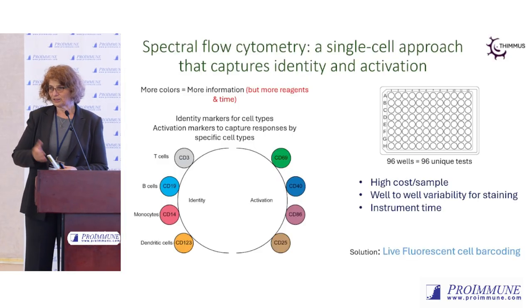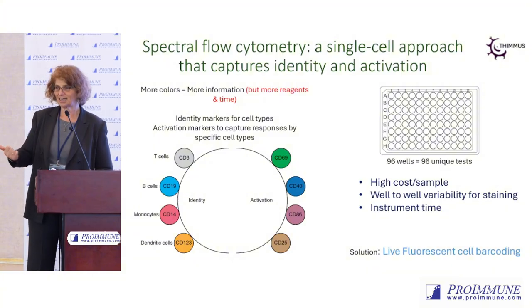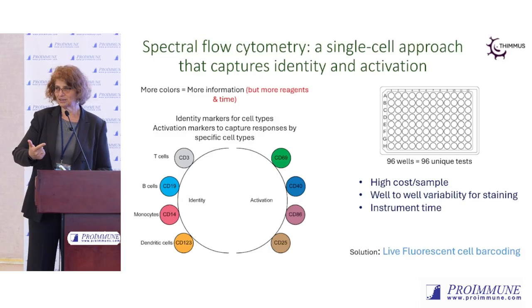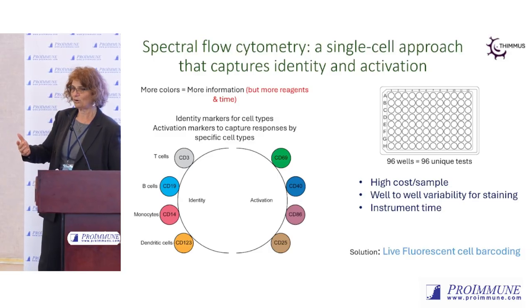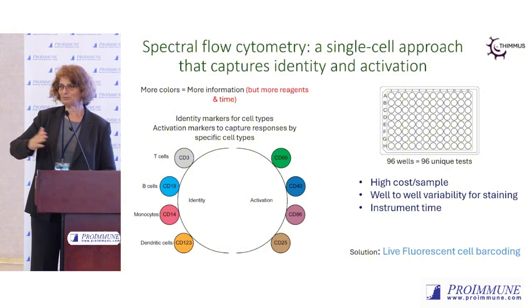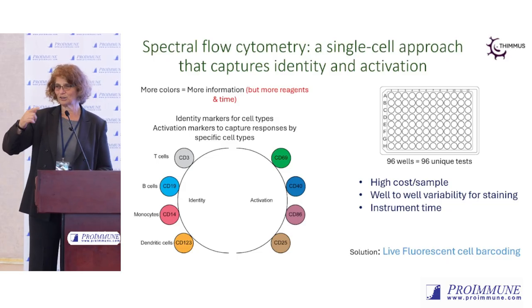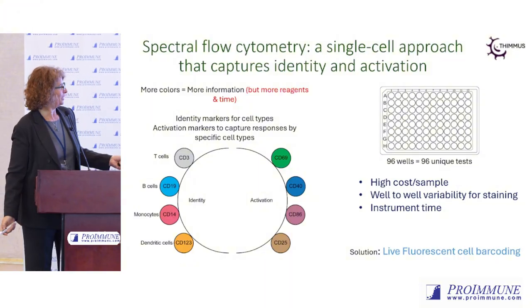Now, we talked about then that it would be very nice to understand what cells are getting activated. And we want to look at multiple responses, right? And now I'm thinking, okay, we have to do that by flow, and we have to start to look at those little cell type groups. You need a number of different markers. For anybody who's done flow cytometry, you're starting to add those numbers of markers and antibodies and controls in your head, and it's getting pretty high, right?